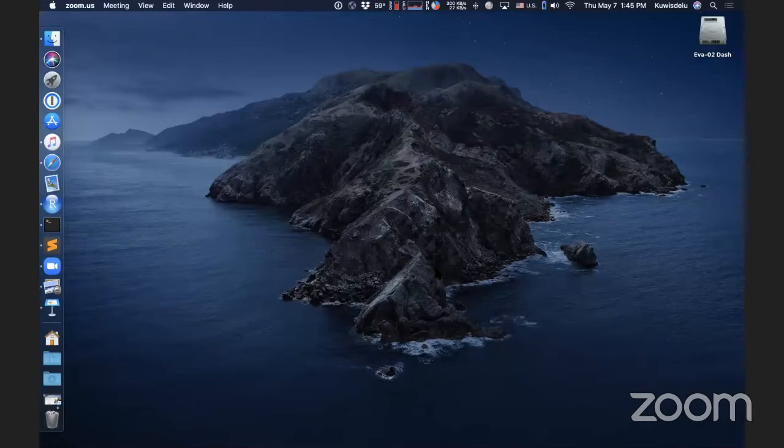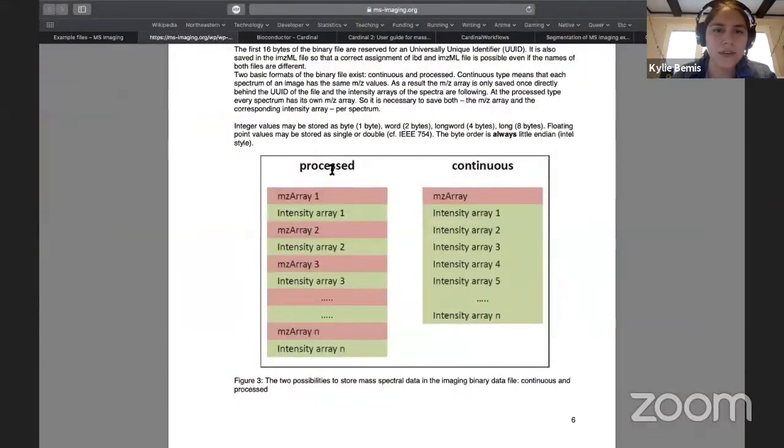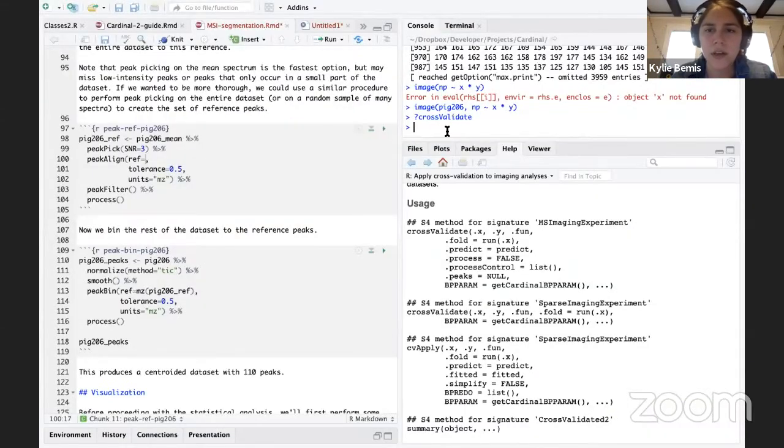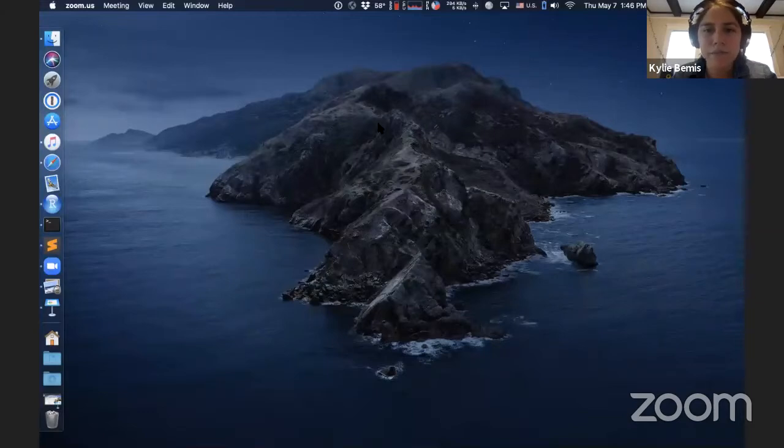Is it possible to extract area under the curve of a feature while comparing normal and diseased tissue? Again, I don't want to go too in depth on specific examples here. By default, there isn't a built-in method to extract an ROC curve for classification. If you wanted to, you can get the probabilities from most of the classification methods that are provided, and then you could plot an ROC curve yourself.